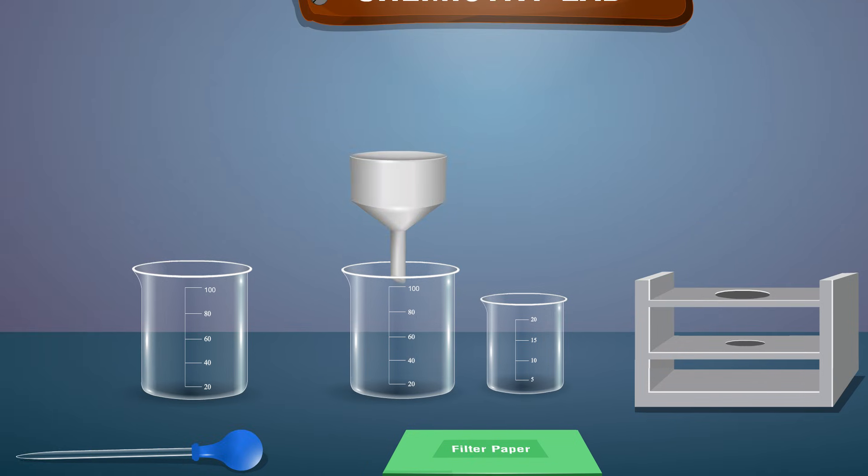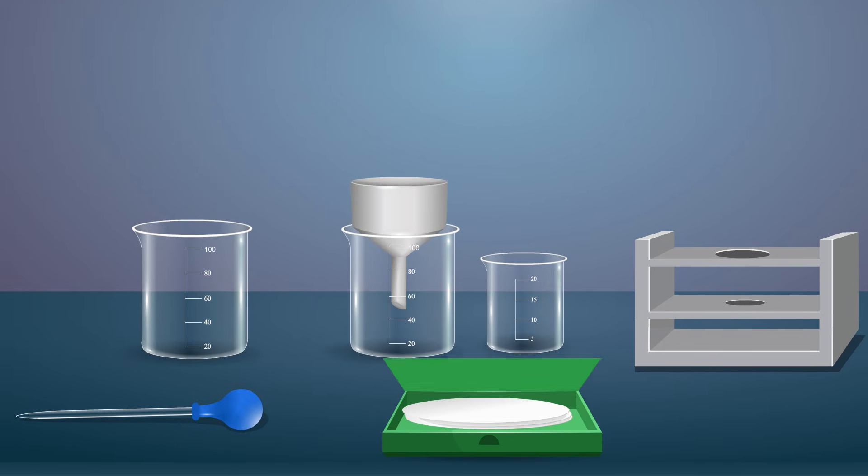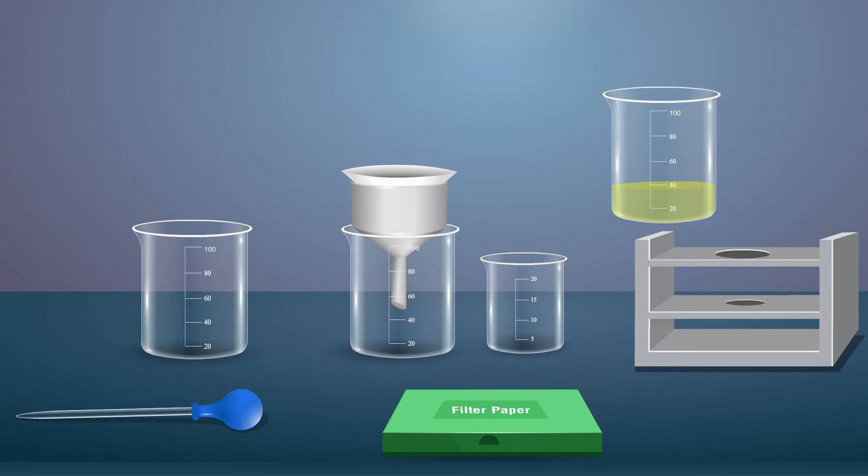Filter the yellow precipitate through a Buchner funnel and dry the crude sample in between the folds of filter paper. A yellow precipitate of para-amino-azobenzene, also called aniline yellow, is formed.